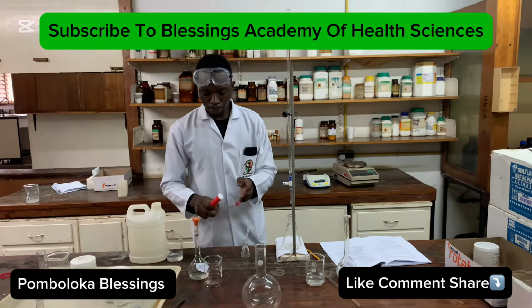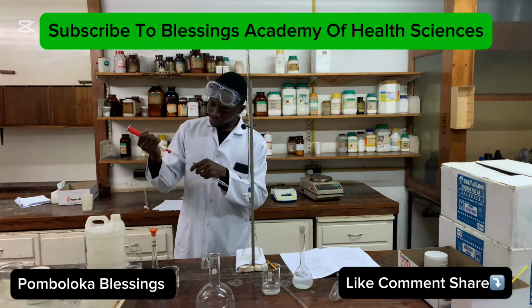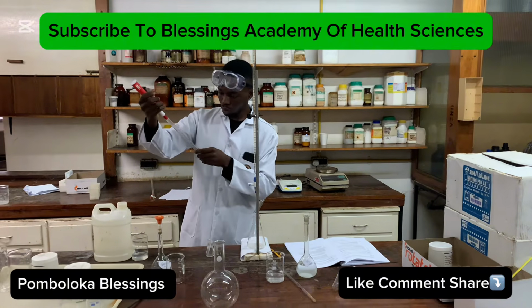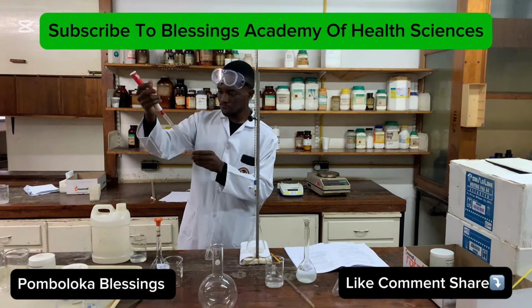And then the second part of the experiment, we're getting 25 cubic centimeters of the hydrochloric acid.